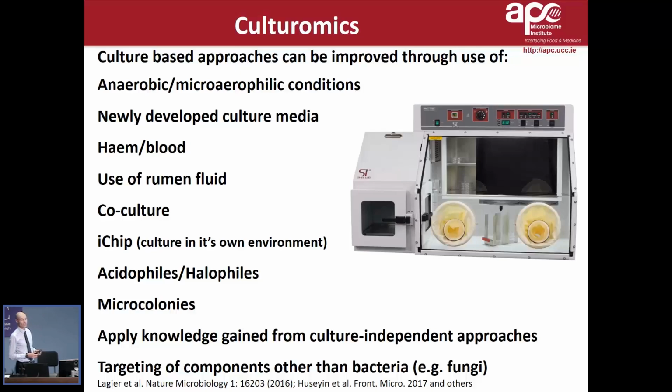Some microbes don't grow well on their own, but if you use a co-culture type approach whereby you have another microbe present with it, that facilitates its growth. There are systems like the iChip-based system, which was developed for soil-based systems, whereby different approaches were used to try to isolate microorganisms in a chip, but then to reintroduce that chip into its natural environment by reinserting it into the soil. The same principle holds true for introducing such chips back into fecal material, whereby the other microbes can't get access to the inside of the chip, but the nutrients that are there can transfer across and the microbe can grow successfully.